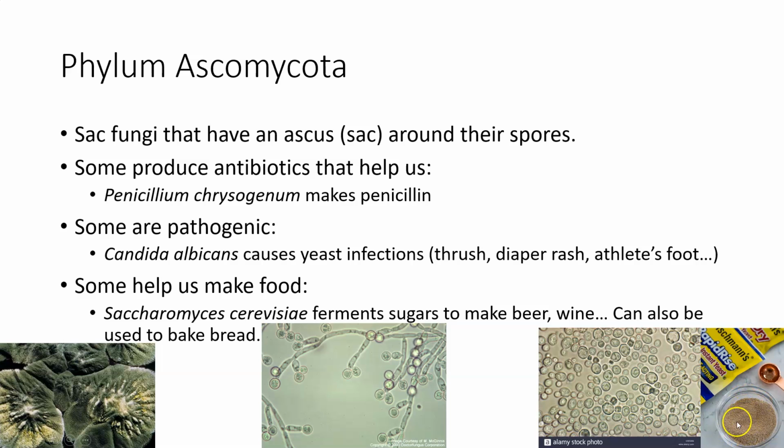But whatever that smell is, that's the fermentation of this yeast so that you can actually make your bread, or if you're a home brewer, your beer or wine or whatever. So I've seen them on practicals literally just throw out a packet of that yeast and ask you what it is. So it's Saccharomyces cerevisiae. It's an Ascomycota, or an Ascomycete is the way you would actually say that. And then it's a fungus.